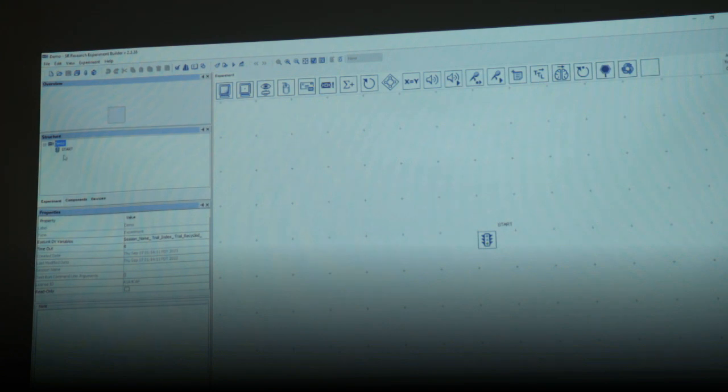Then the structure does the same thing. This structure window does the exact same thing. It shows you a flow of the experiment, but with a tiny icon and a word. That word is a label that you give to that particular icon. Okay? So if you're dragging a screen and calling it fixation, you will see fixation, right?